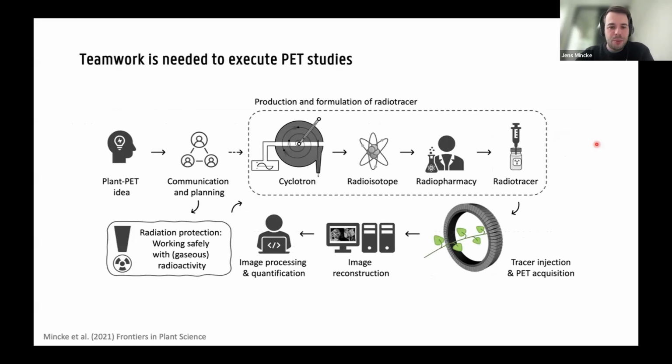If you want to start performing PET experiments on plants, you should be aware that this requires a lot of teamwork. Of course, it starts with a plant PET idea, which has to be communicated with all involved parties. And you have to take into account that you're working with radioactivity, so there should be, of course, some radiation protection.